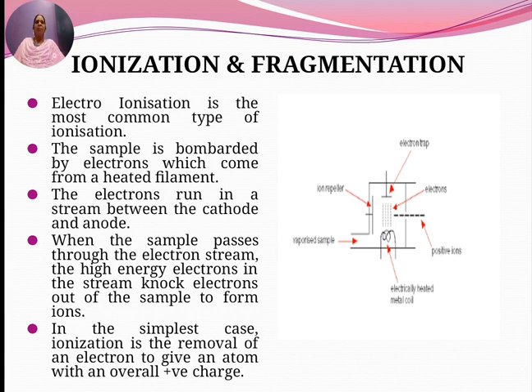When the heated filament emits electrons in the form of a beam, the electrons run in a stream between the cathode and the anode.